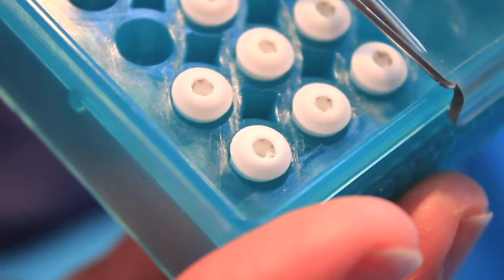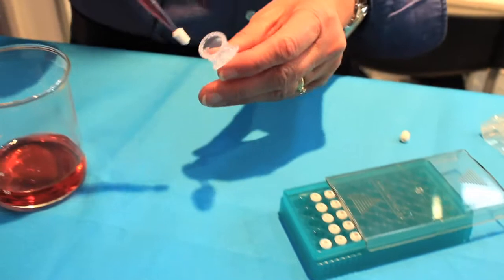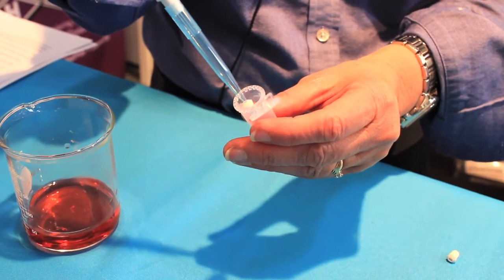FlowMe is designed for small volume samples — 1000 microliters or less — and your sample should have no more than 2 million cells per 1000 microliters. Attaching FlowMe to the end of your pipette tip does not require a lot of pressure, about the same as you use to attach the pipette tip itself. FlowMe has been tested with most major brands of pipette tips and found to be compatible with all of them.